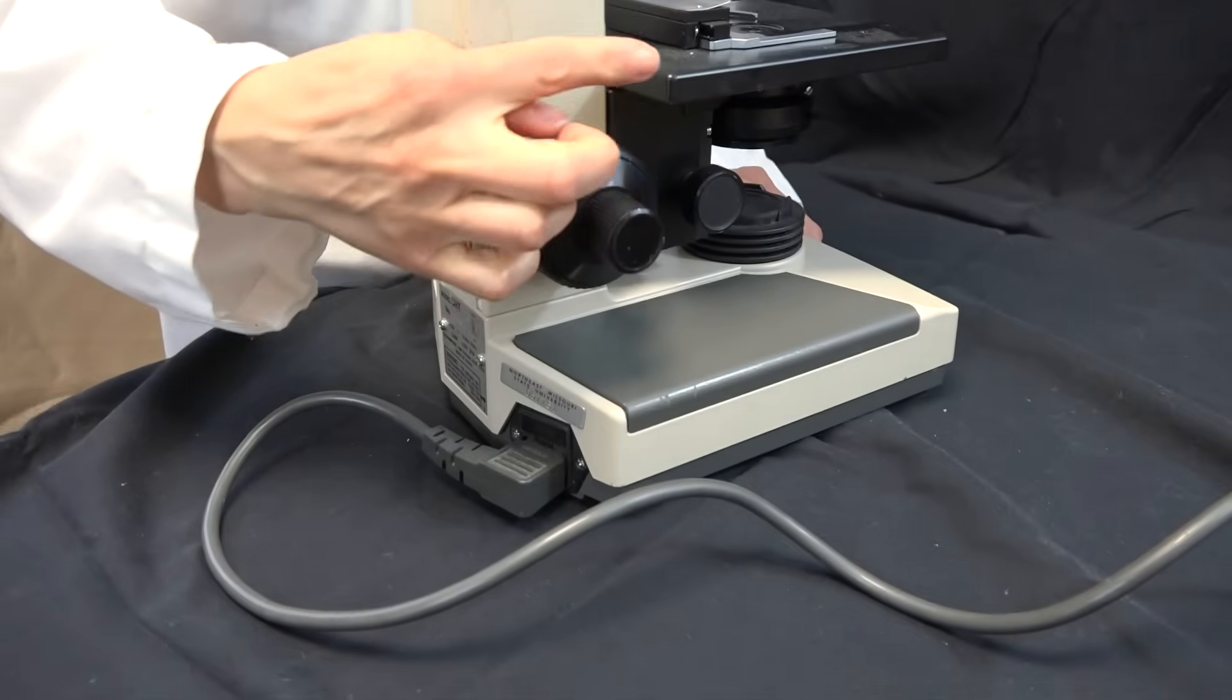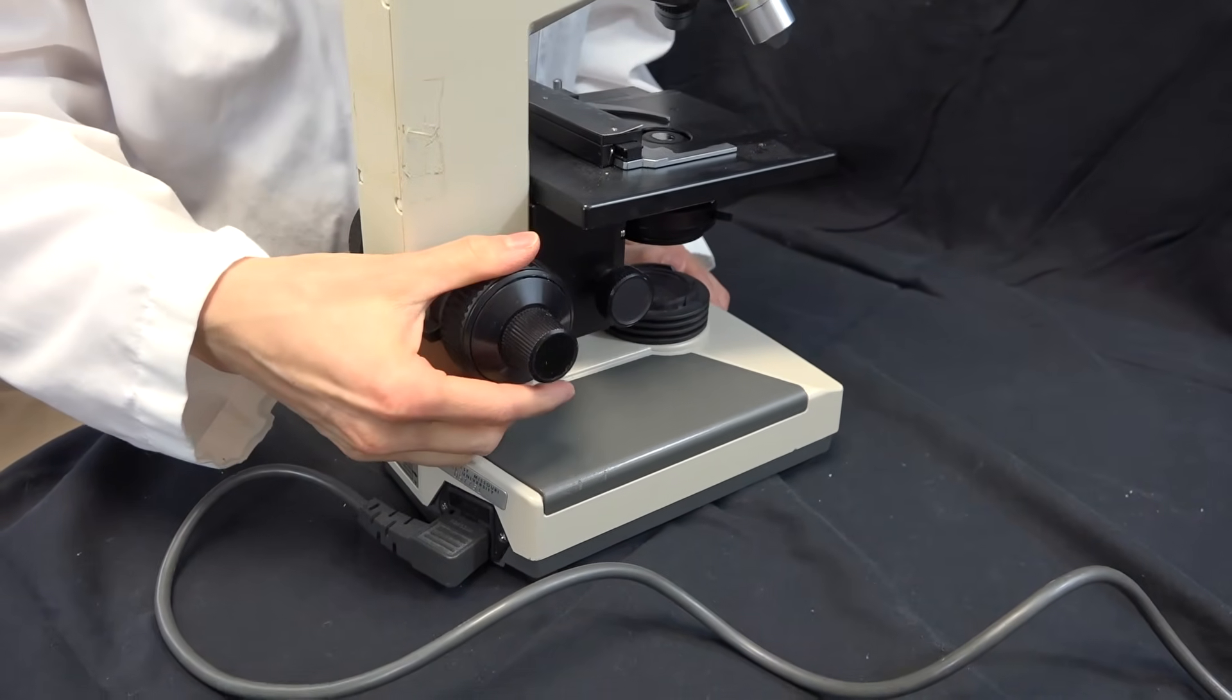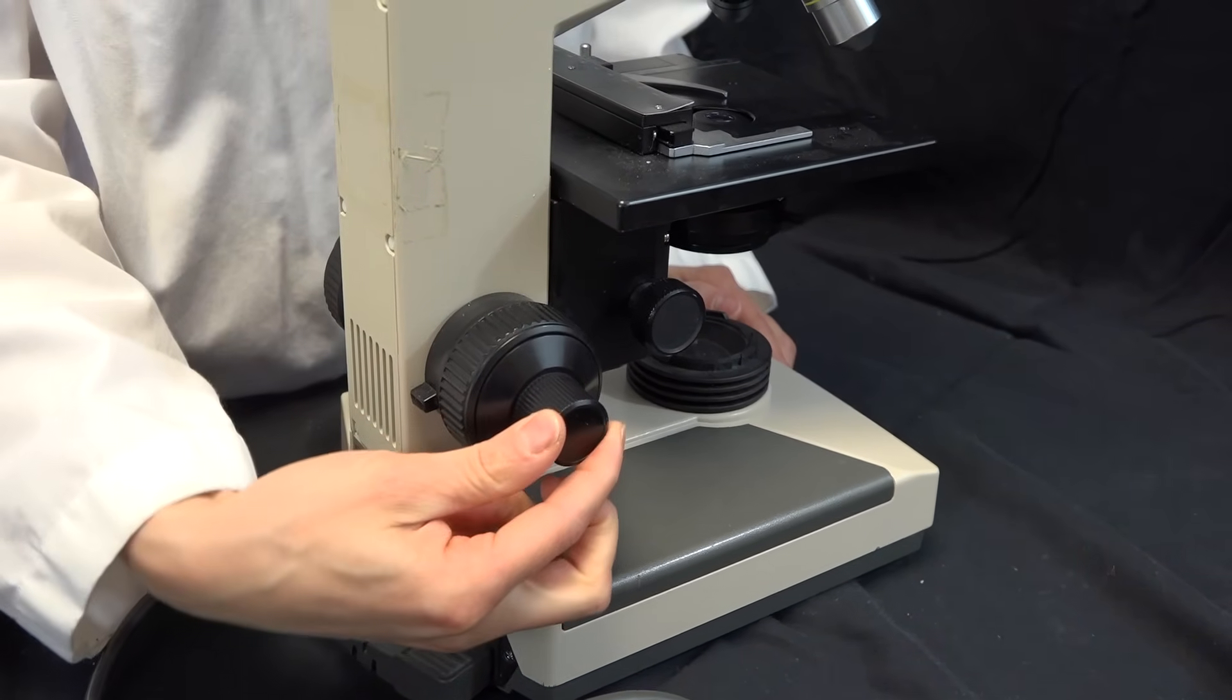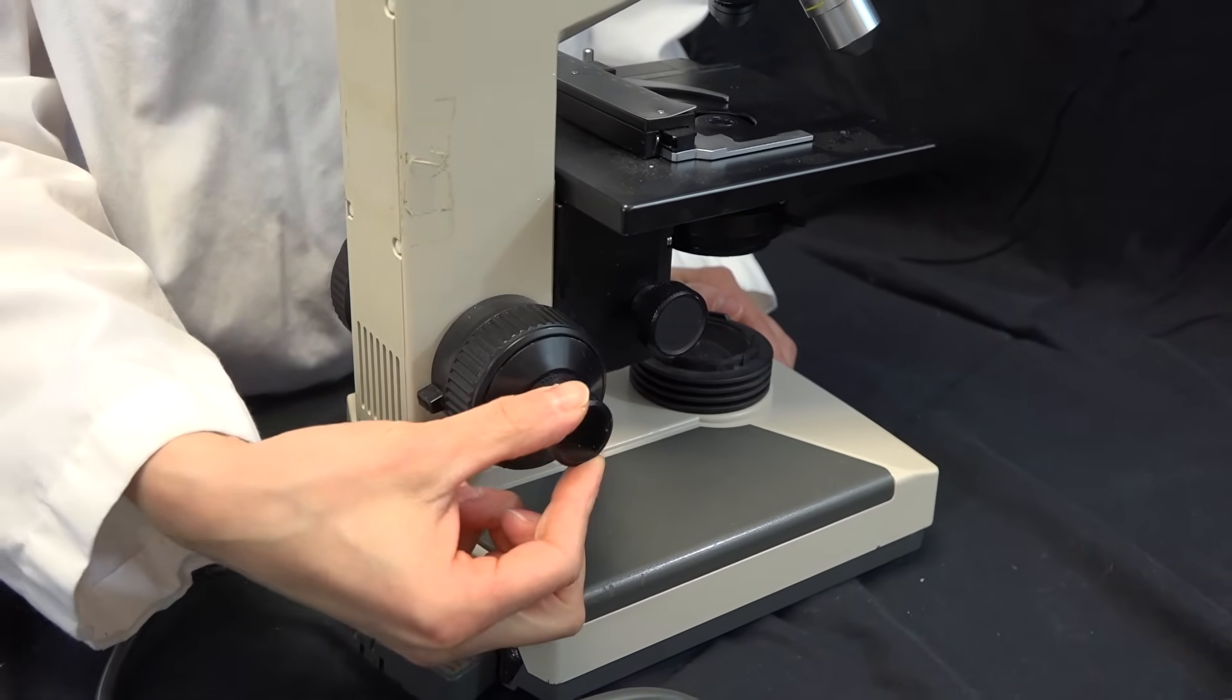These dials move the stage up and down to help focus your specimen. The coarse adjustment moves the stage quickly. The fine adjustment moves the stage in much smaller increments.